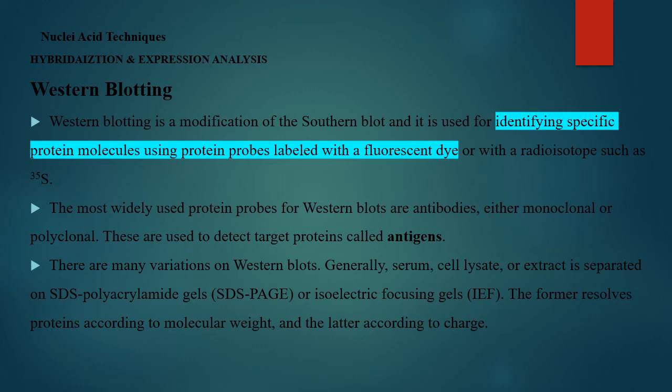Generally, serum, cell lysate, or extract is separated on SDS polyacrylamide gels. Last time I asked about SDS. That is SDS polyacrylamide gels. Go find out about the SDS portion of it. Or isoelectric focusing gels, IEF.